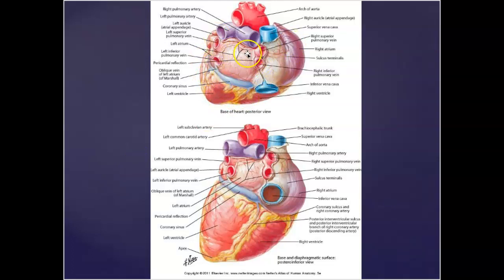The left atria is more on the back side. It receives blood from those 4 pulmonary veins from the lungs, so oxygenated blood back into the left side of the heart, and blood's going to go through the AV valve here in a second, the left AV valve. But let's just keep on this side for a second. You can see the auricle pushes way back to the back side. I just wanted to show that again, it's on the back side. So remember when you were cutting here, those pulmonary veins, you were doing it kind of blind, okay?